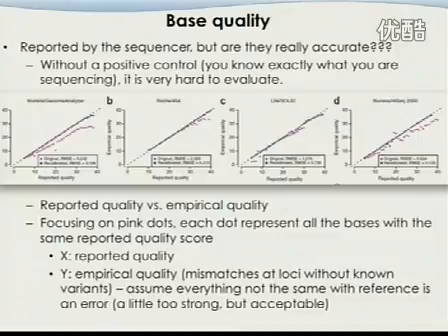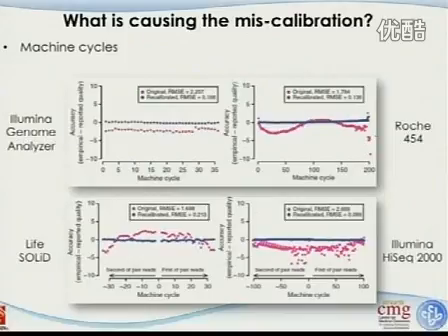Sometimes those may be real, but I think those numbers are really tiny, and this type of evaluation is acceptable. So this really tells us that sometimes we probably cannot believe what sequencers report, and we need to do some recalibration to correct this. We'll talk about the recalibration, but the point here is that the blue lines are the recalibrated ones. You can see that after their algorithm, it comes back a little bit.